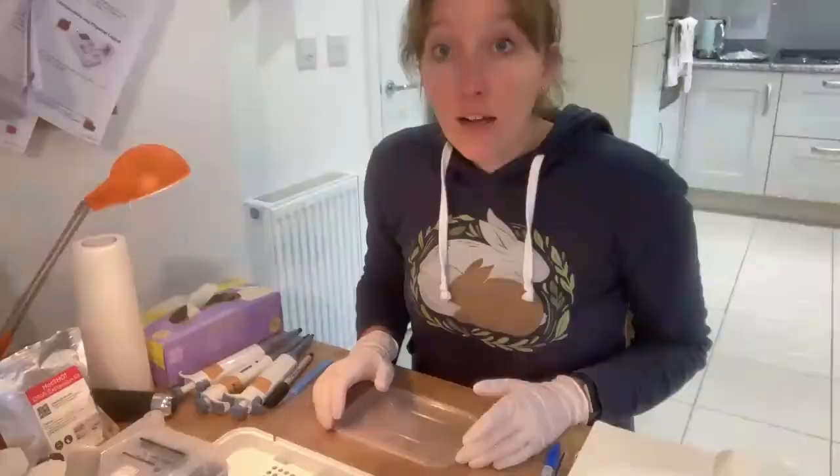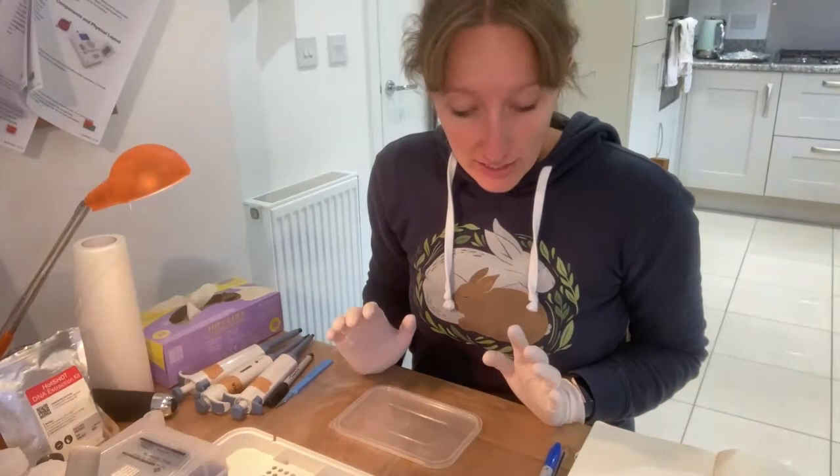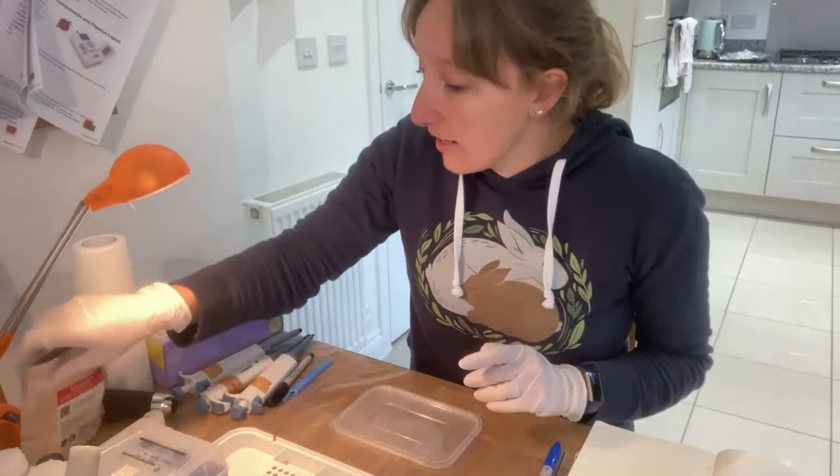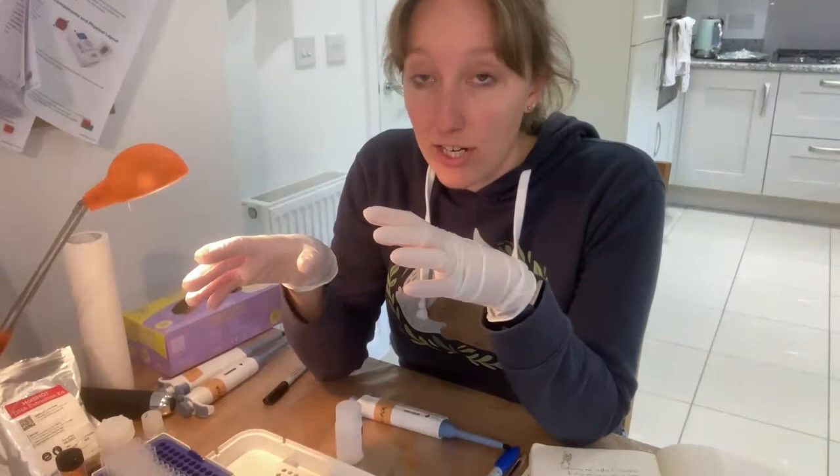Now I've collected the mushrooms and they've arrived in the post, I'm going to show you how to extract the DNA from them using two different methods: the Hot Shot DNA extraction kit and the dipstick DNA extraction method. The reason I'm doing both side by side is because sometimes one extraction method might work better than the other, and basically the methods are so easy I just have them written on two post-it notes.